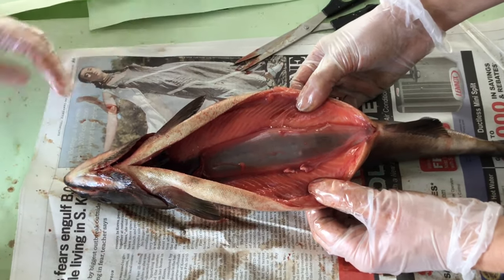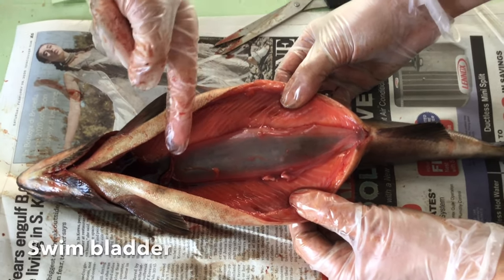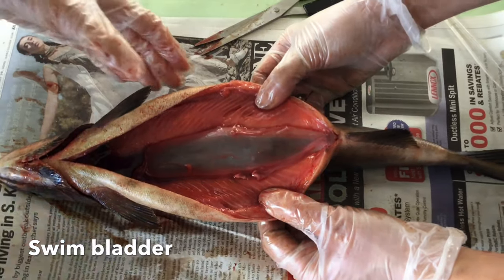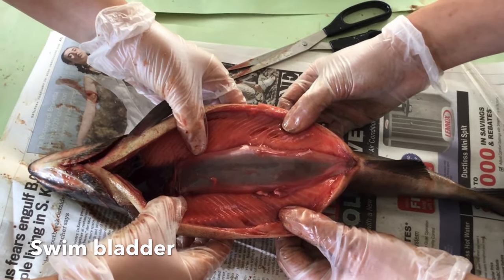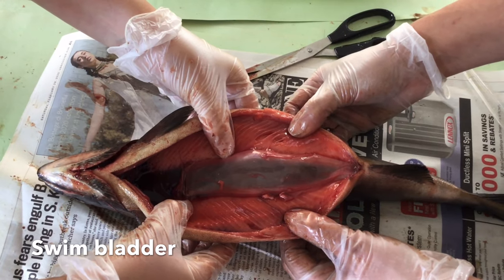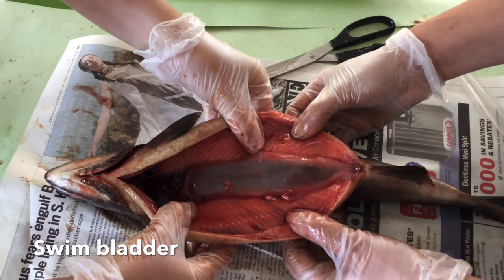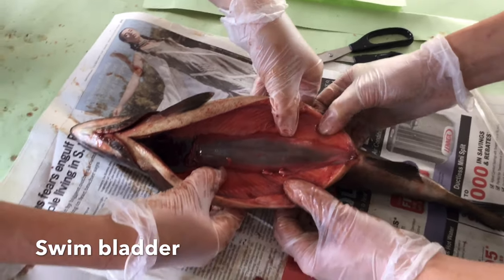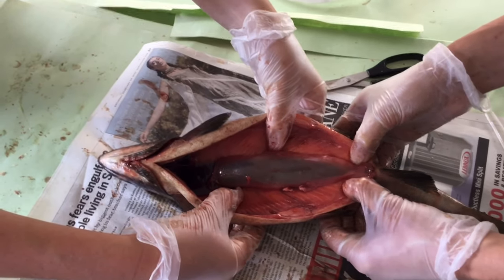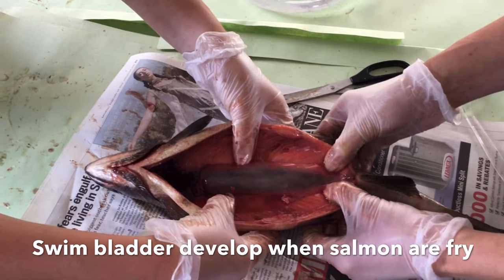And now we are going to remove the swim bladder, and look how large that is. It's huge. This is another careful operation to get the swim bladder out. As fries, that is when salmon first develop their swim bladder, and they must fill it with air. That's why they're called swim-up fries. This allows them to become buoyant in the water.